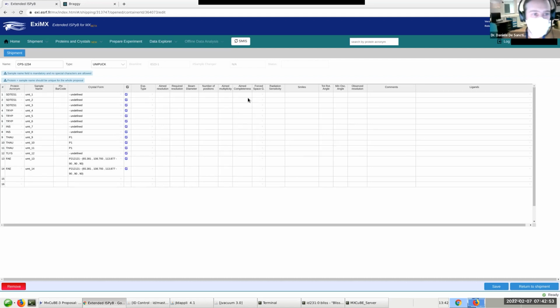what we can do. So for example, here on the right, you see this is very important because I showed before ligands. I can add one of the descriptor of ligands inside here. This means that if the automatic molecular replacement is successful, then the software will also try to fit the ligands inside. These are the ligands that we defined together earlier. So I'm not putting there because these crystals don't contain ligands.